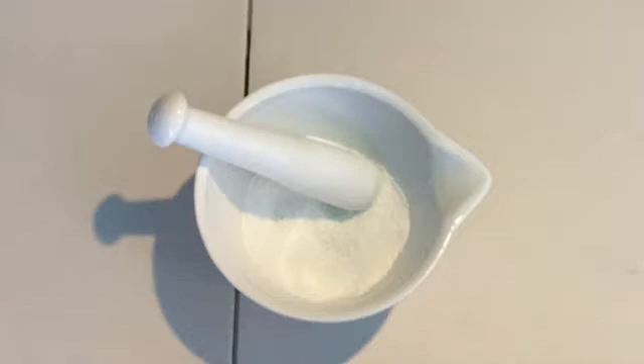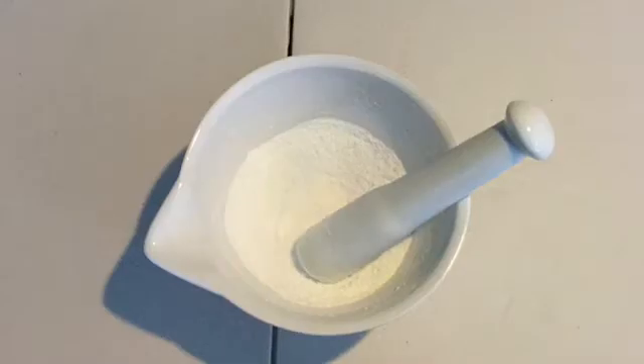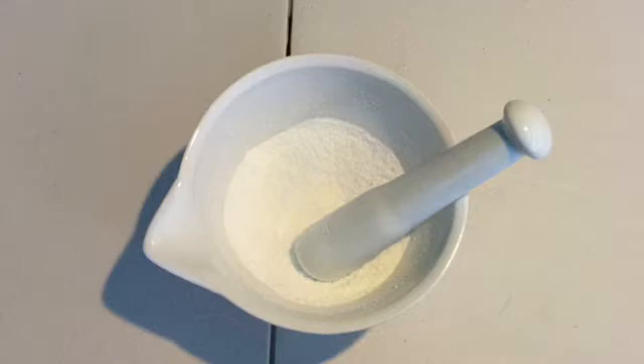Five tablespoons of sodium hydroxide were added to a mortar. The quantity used was measured in tablespoons, which is very inaccurate, and a scale should be used. The reason a scale was not used in this experiment is because it recently ran out of battery. The sodium hydroxide came in a small spherical bead form, which was crushed into a white powder. This helps for the dissolution of sodium hydroxide, however it is already highly soluble and I'm not sure if this step is necessary.